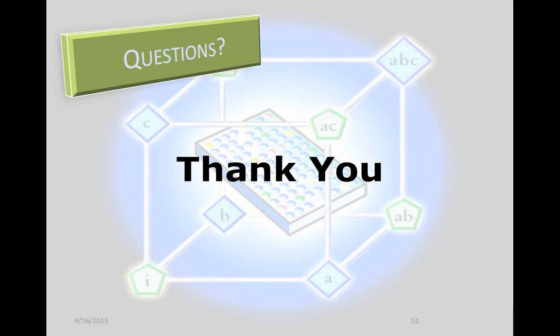And then, of course, you'll need the AAO software. You'll need some sort of statistics software, or if you're comfortable creating them yourself in Excel, you can do that. I recommend having statistics software just because it helps direct your experimentation and keeps you on track. I think that's about it. We do use Excel pretty extensively as a means of data collection and a quick way to turn files around.